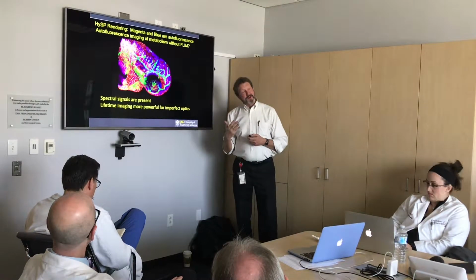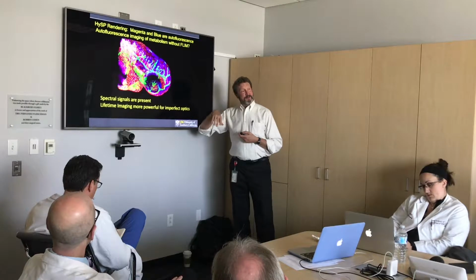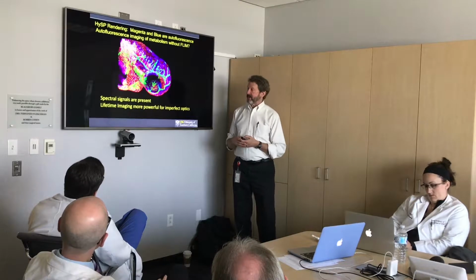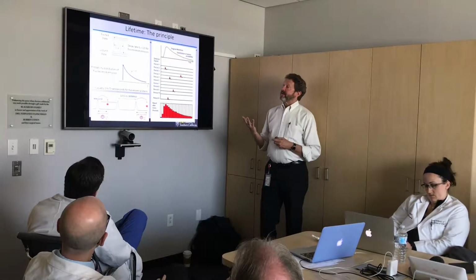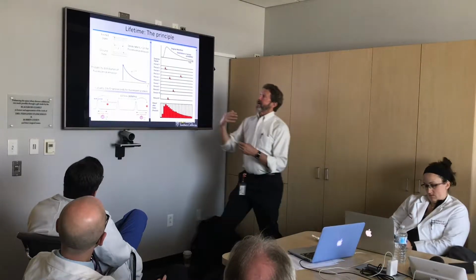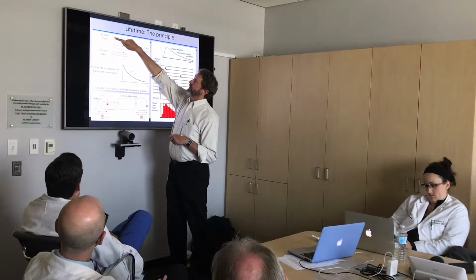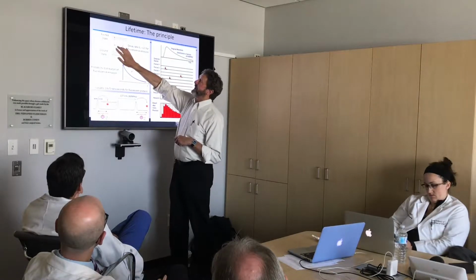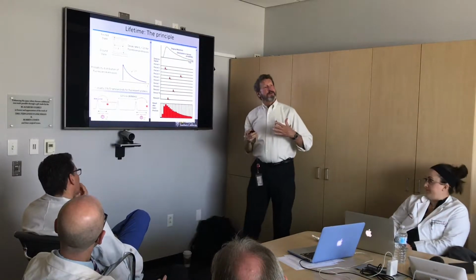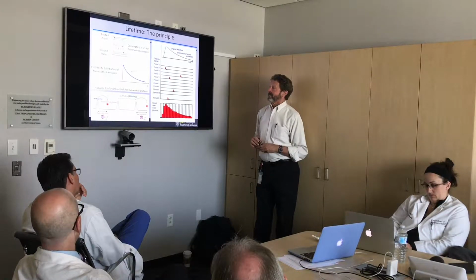And as we started looking into more and more hostile environments, I have to admit that the other lesson from Enrico Gratton is that lifetime imaging can be better than multispectral imaging. Lifetime is the amount of time it takes for a fluorescent signal to give off its photon. A chemist would think about a dye molecule in a ground state: it absorbs a photon, it gives off a photon, and it takes some nanoseconds for that to happen. That happens, for example, in different metabolic states of the tissue. That could change tenfold for some of the endogenous fluorochromes.